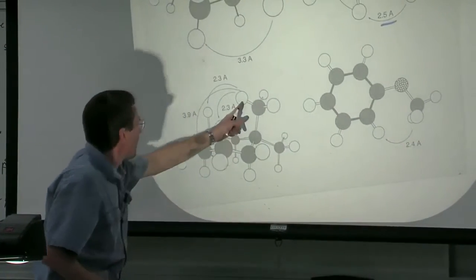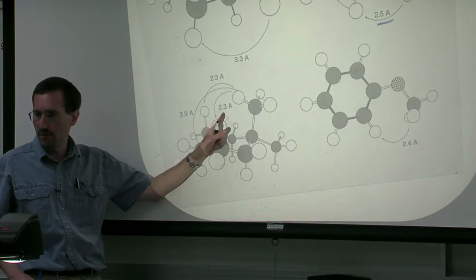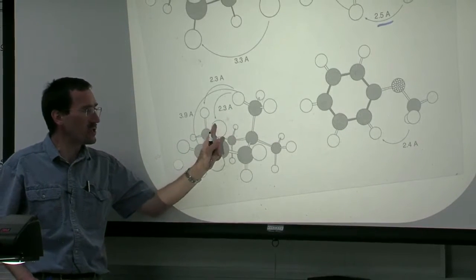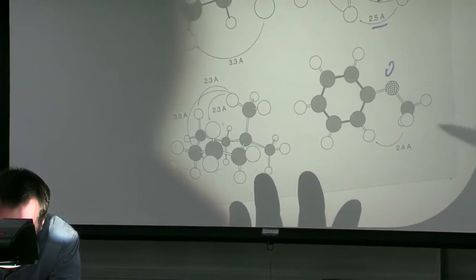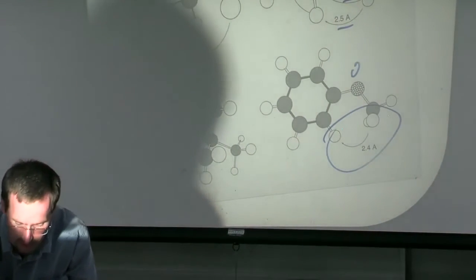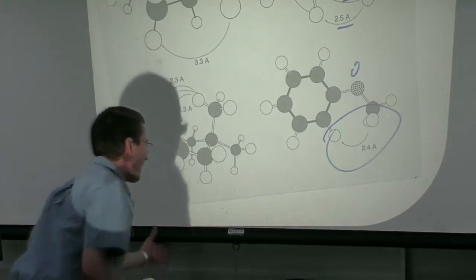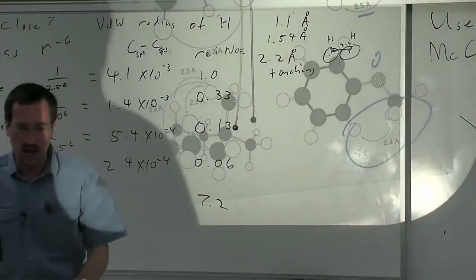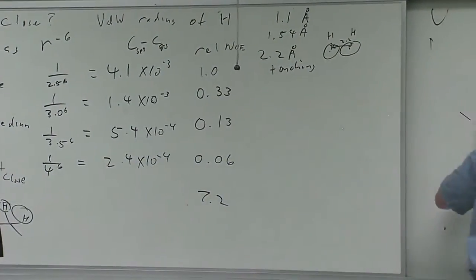I put an axial methyl on a cyclohexane, and you can see that axial methyl bangs into the hydrogens here very nicely. This is a methoxybenzene, and you can see the ortho relationship is also good. All right, I want to finish up with a couple of additional comments and one last example.